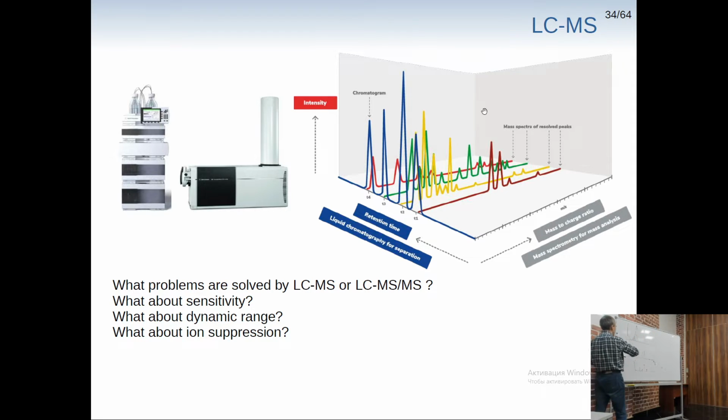But if you don't have this information beforehand, you only have information on the rising concentration of some precursor ions, right? And if the peak is small enough, you can have an idea that it will be getting higher and higher, and postpone the time of analysis and analyze somewhere here or even after it is already gone, right?